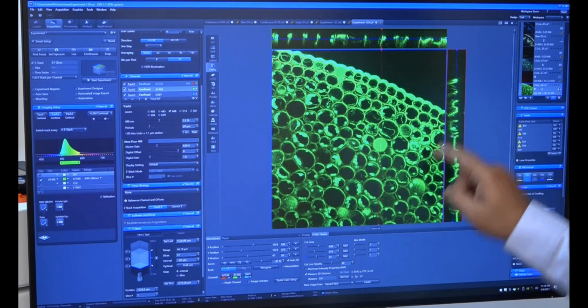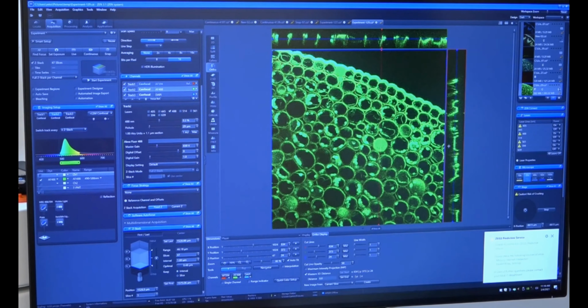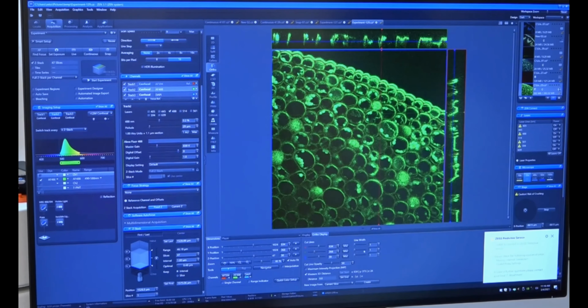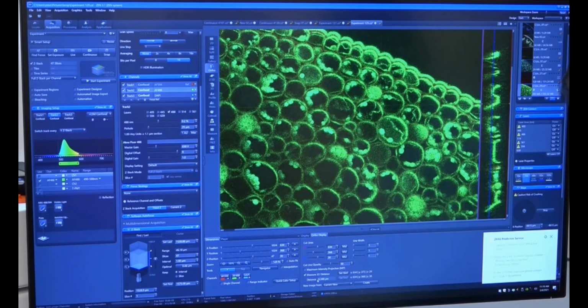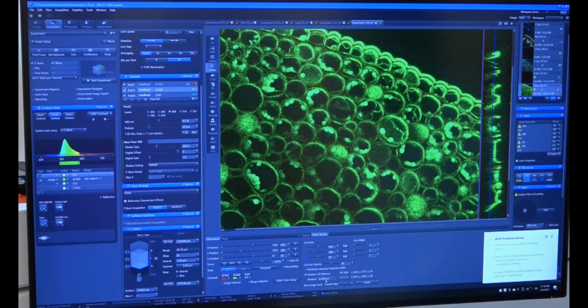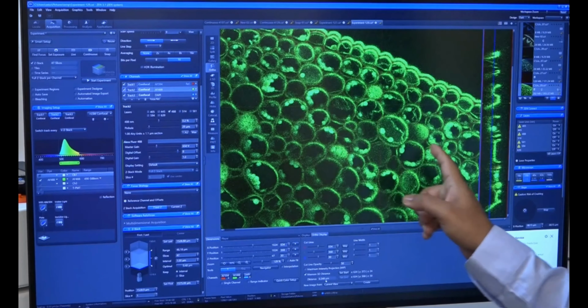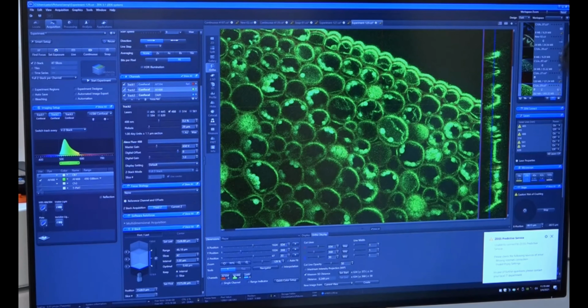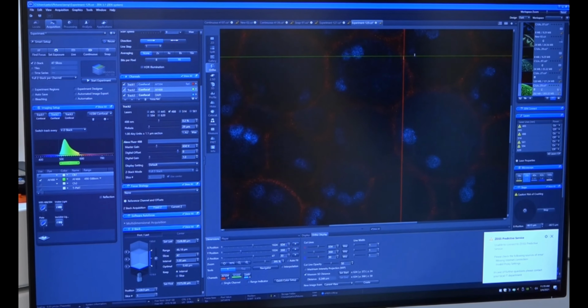As you can see here, we can also have the set end position, and in the set end position if you click on the other side, we can say this is my set end position, and based on the start and end we can have the distance which is 6.348 micron. So in the Z, what is the thickness, that also we can see here. I think it is not that clear. So if you can see here, this is the measurement we did.